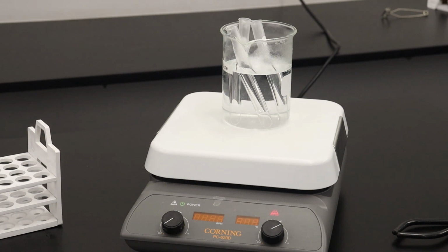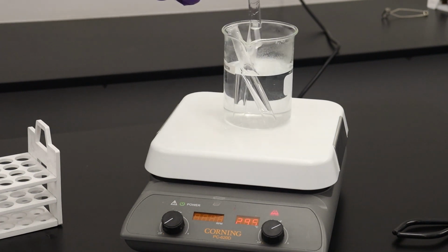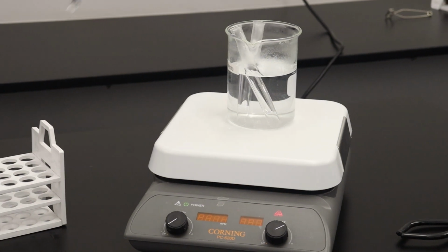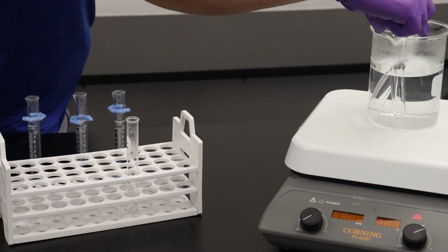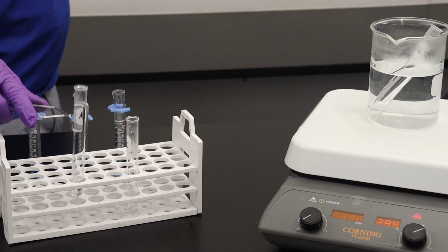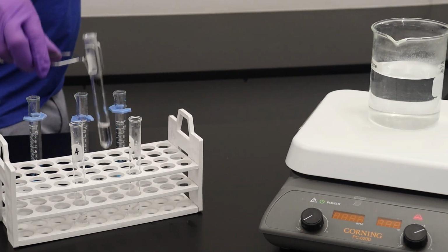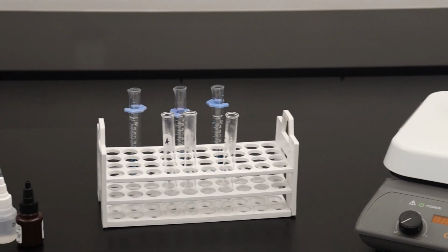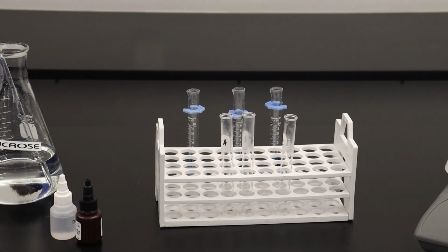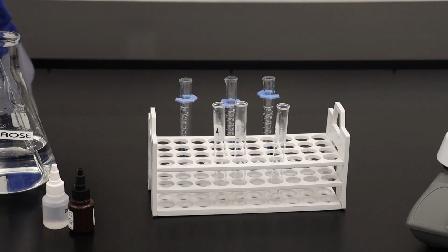All right, now that the samples have been boiled for 4 minutes, we can remove them from the water bath using our test tube clamps. Now we're going to repeat the Benedict's test to check for the presence of reducing sugars. Benedict's reagent is going to be added to each test tube.